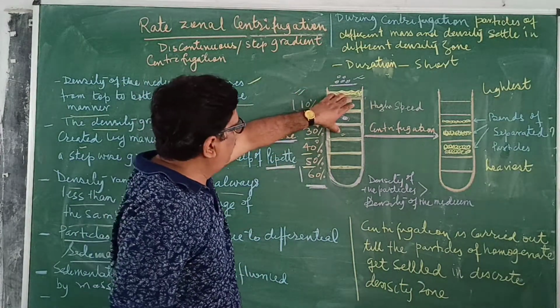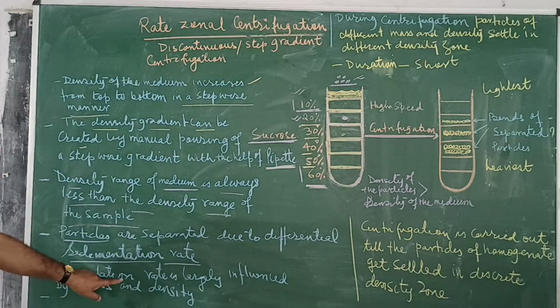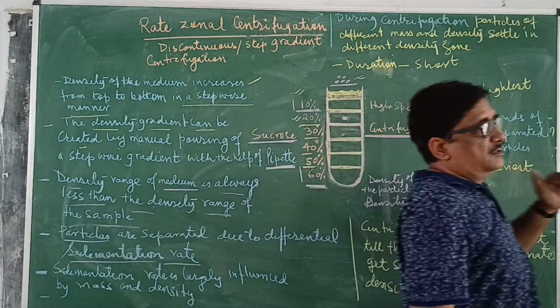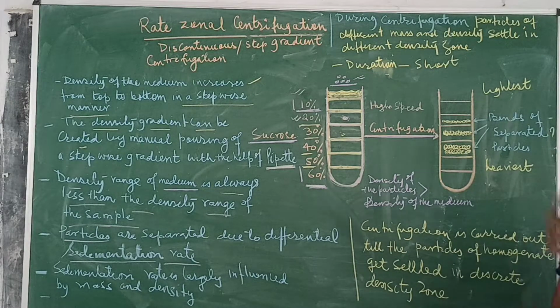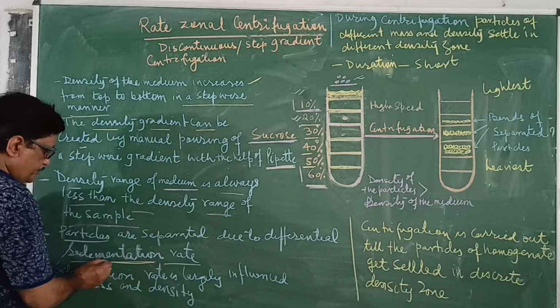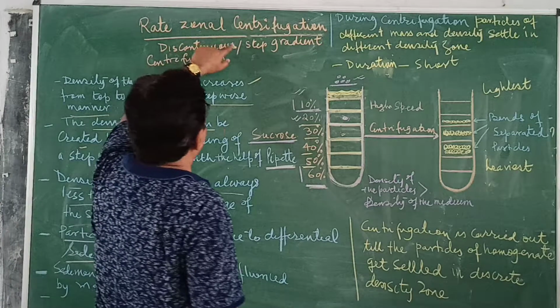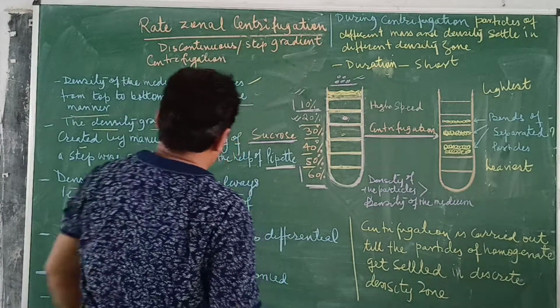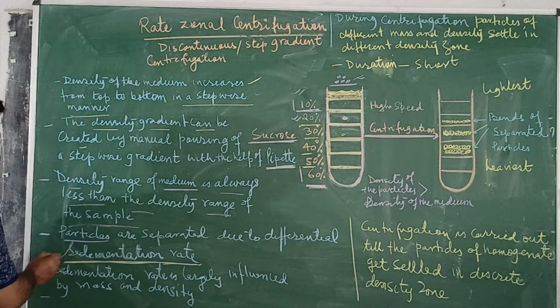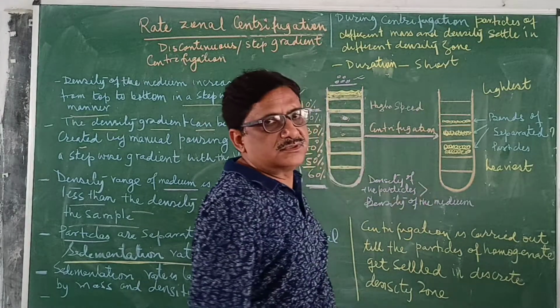Sedimentation will take place due to differential sedimentation rate. We have already discussed what the sedimentation rate is and what factors influence it. So in step or rate zonal centrifugation, the differential rate of sedimentation is the cause of separation of molecules.